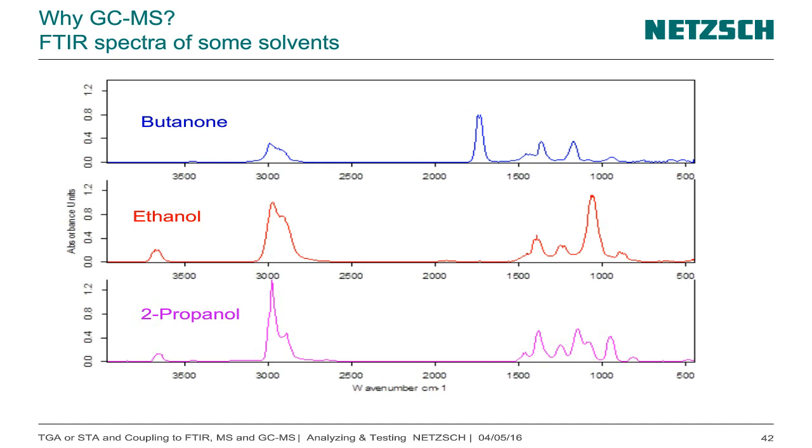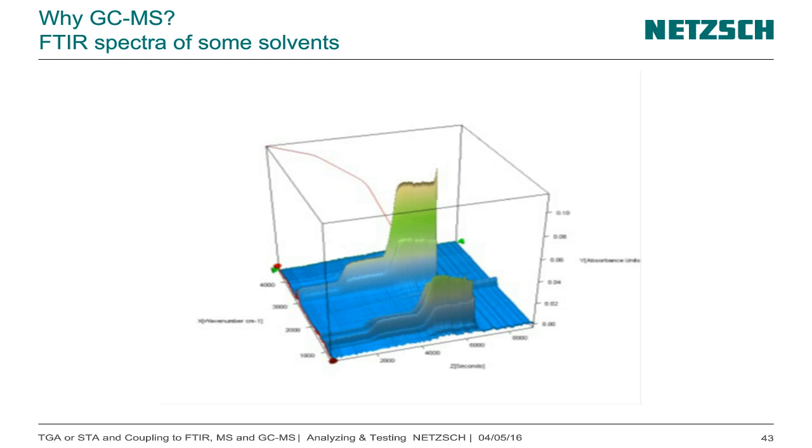What I have done was putting a small amount of this mixture into a crucible, heating it in the TG and analyzing it with the FTIR, and you see that I used different heating rates. With the different heating rates you see different mass loss in the back from the TG curve, and in the front you see the increase of the FTIR spectra.